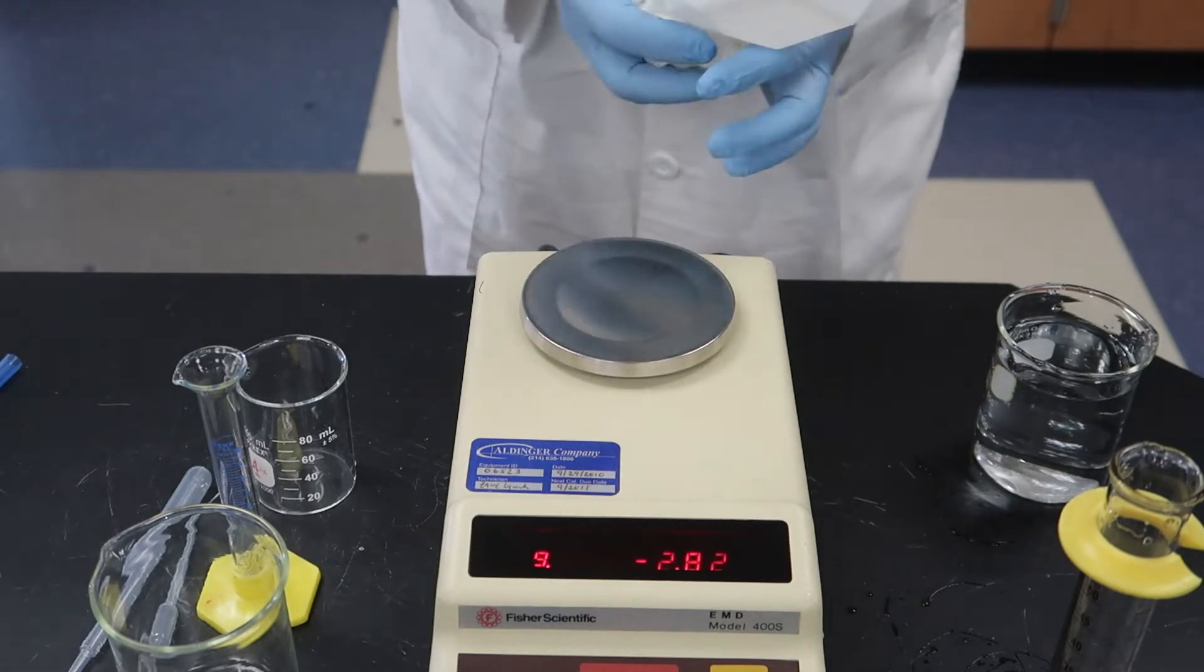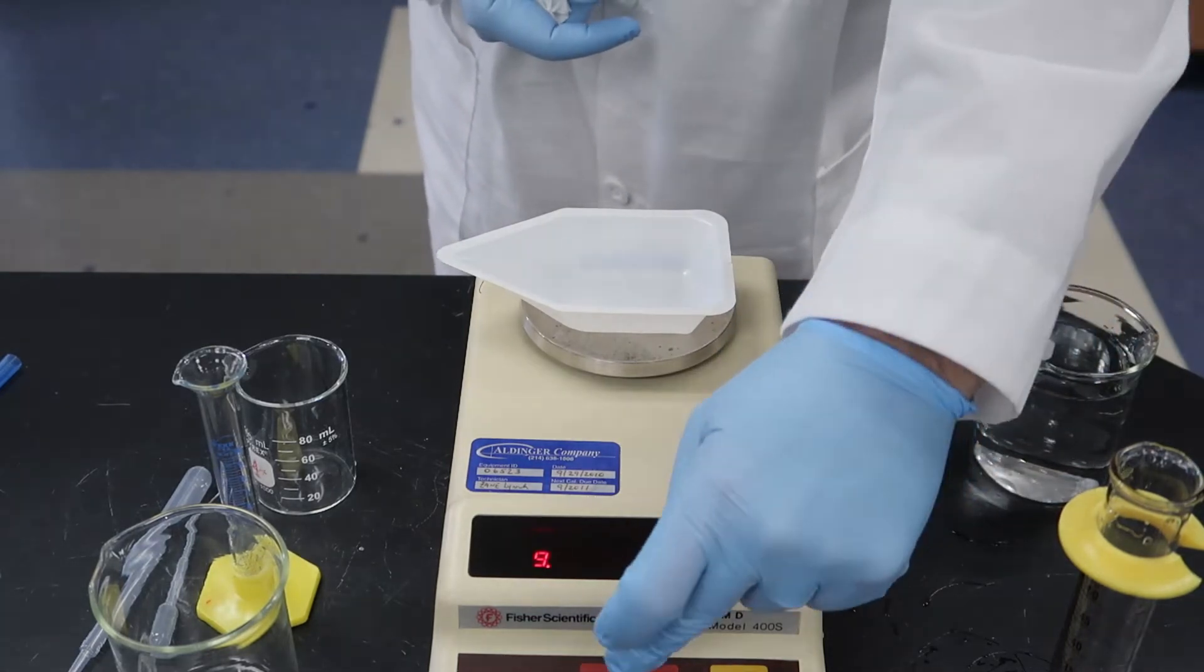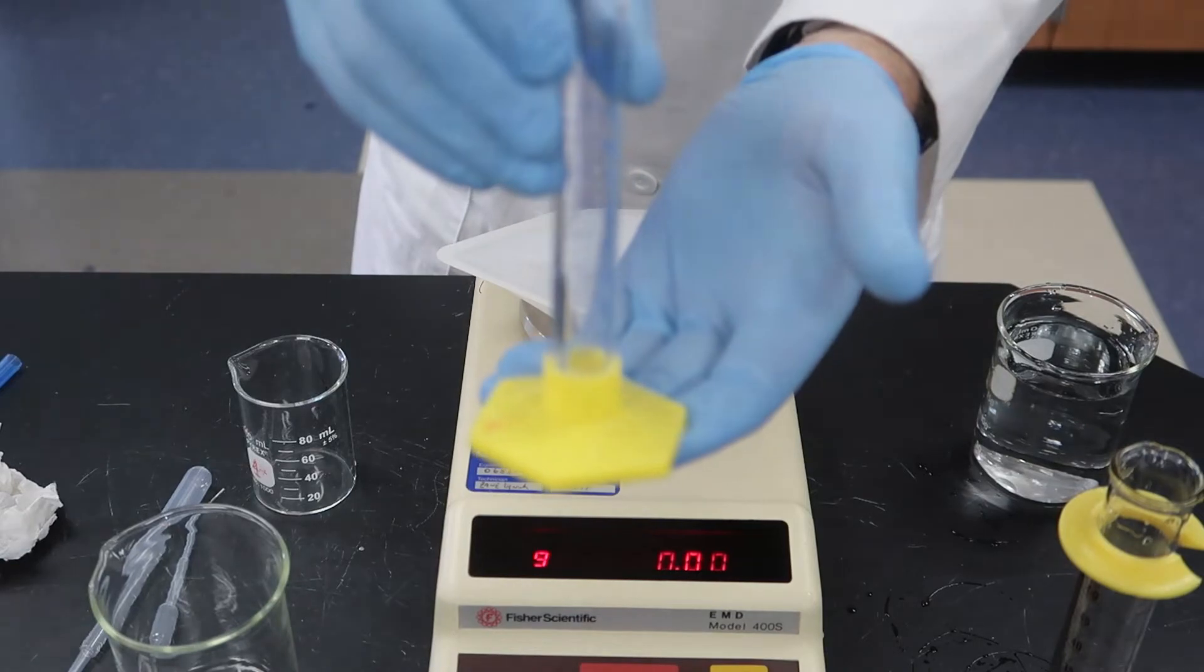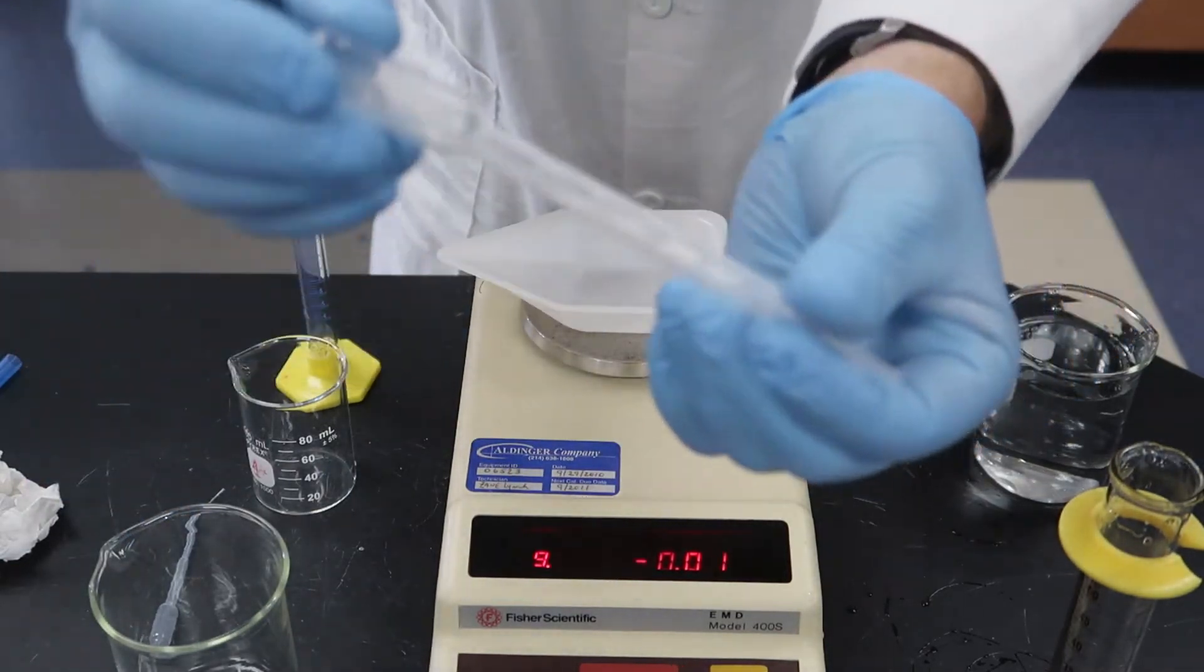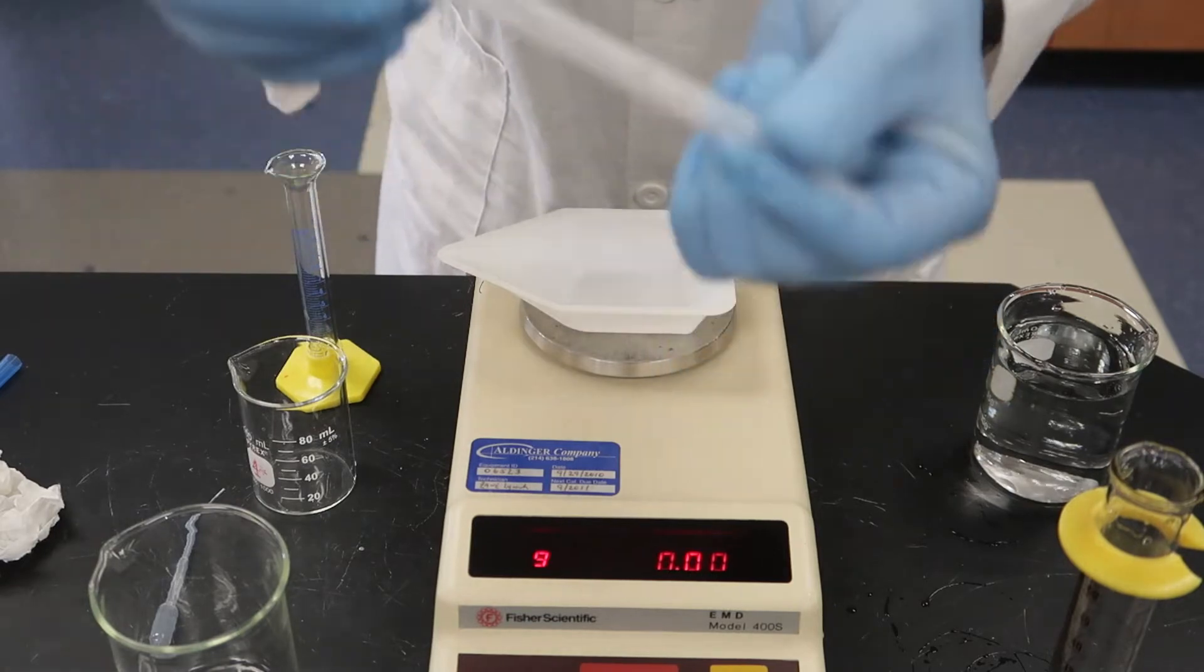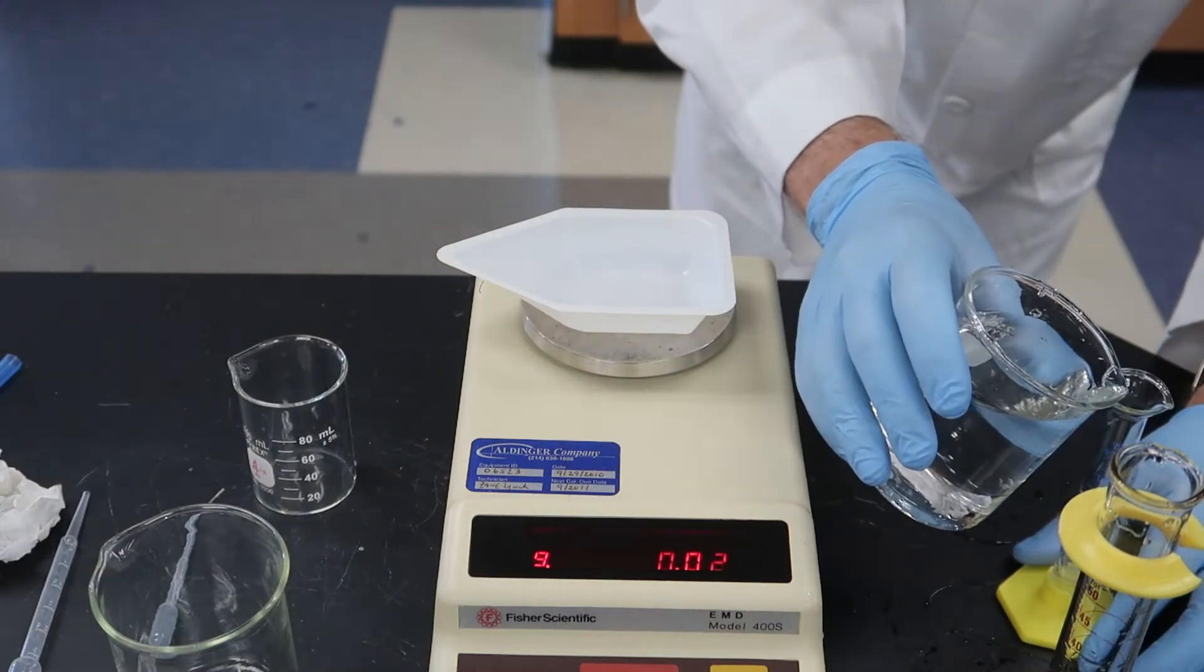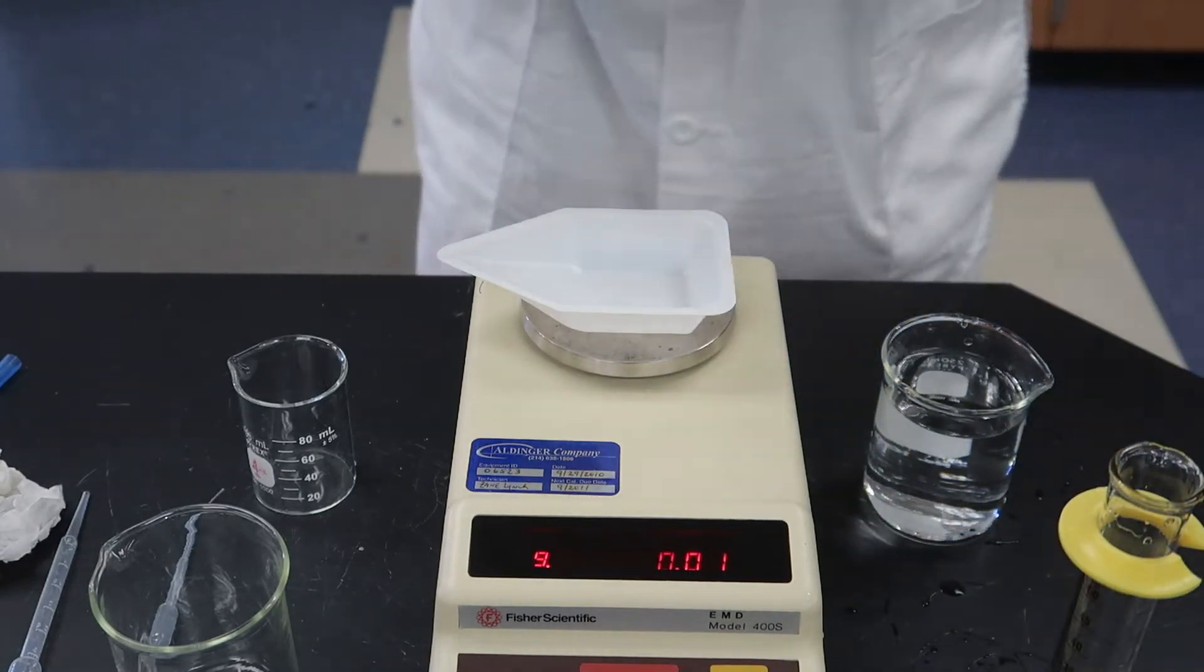Okay, the next volume that we want to measure is 2 milliliters. Again, we have to decide what piece of equipment to use. We could use a graduated cylinder. This graduated cylinder is marked in tenths of a milliliter. We could also use the graduated disposable transfer pipette. It's blurry so you can't really see the numbers on there, but it is marked in half milliliter increments up to 3 milliliters. But let's go with the graduated cylinder. I think that would be a better choice.